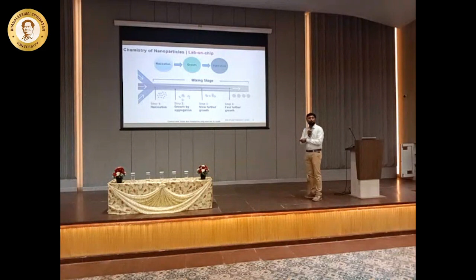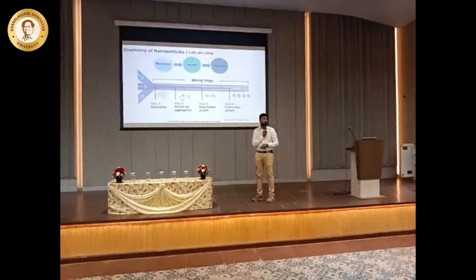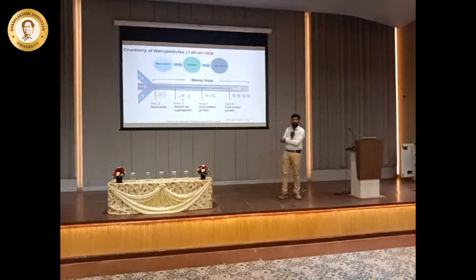Here I'm controlling the flow by a syringe pump. A syringe pump is a device wherein you can infuse the flow of fluids in the channels, in the microchannels. We can see how much concentration has to be given. Here I'm trying to tune the concentration only by using syringe pumps externally.